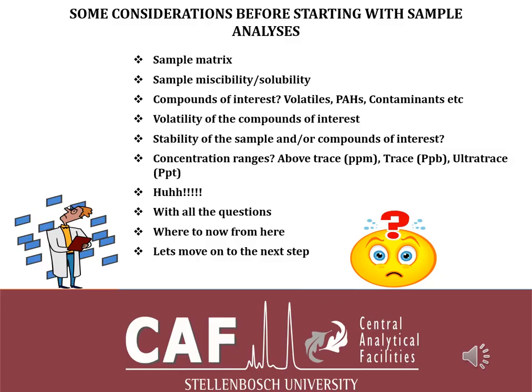For me, ultra trace is anything in the ppt range, or maybe from 1 ppt to 1,000 ppt, or even lower. You can also regard anything below the ppt level as ultra trace.